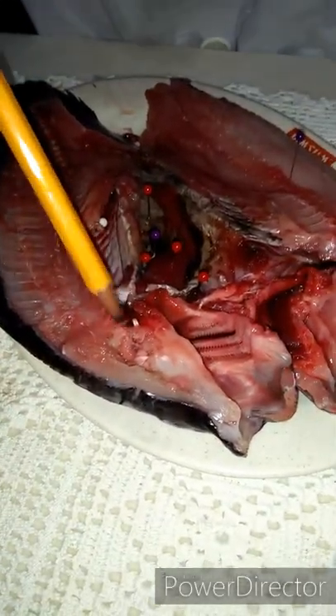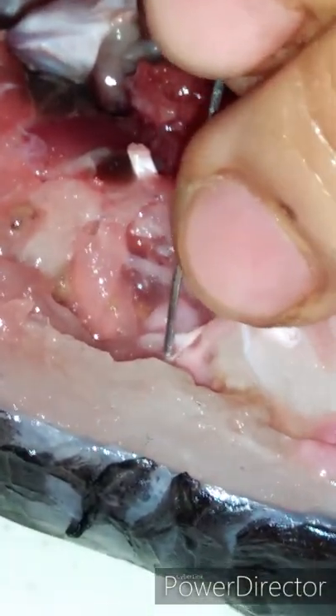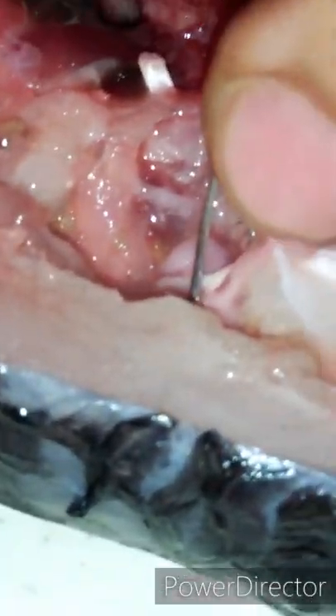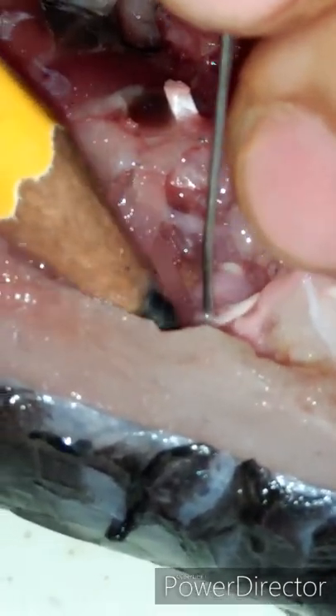This white part here is the brain. The brain is the control center of the fish, and all sensory information is processed here. Those are the basic internal parts of the fish. I hope you enjoyed and learned something from this video — thank you!